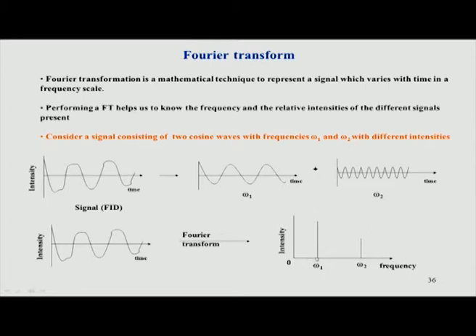If you see here now, the intensity of this peak is directly proportional to the number of hydrogens here. In the case of methanol, we discussed that there are 3 hydrogens. So, this signal will be 3 times stronger compared to this. Of course, in this picture it does not look like so, but qualitatively you can think of it that this particular thing is 3 times this. It basically depends on the number of hydrogens. If you have 4 or 5 or n number of hydrogens, this signal will directly be related to the number of hydrogens, and this is also similar.